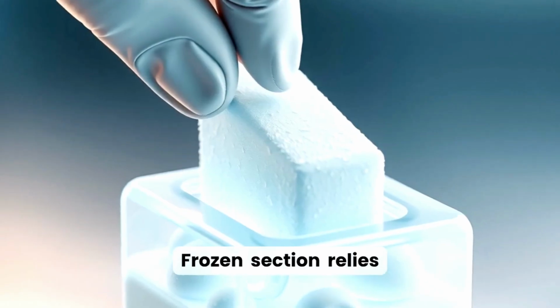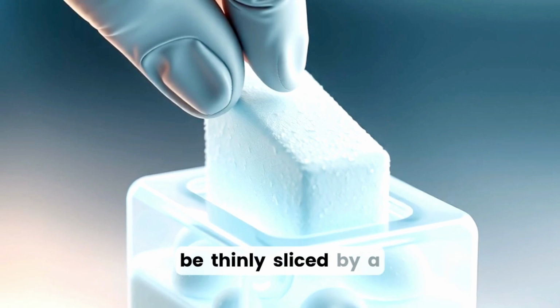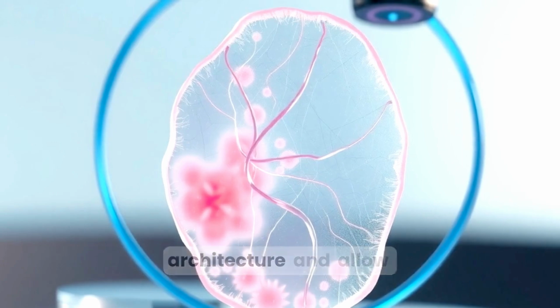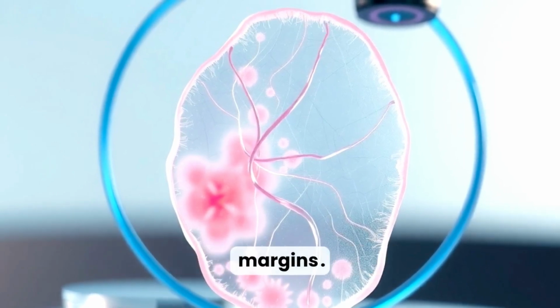Frozen section relies on rapid freezing of tissue to create a rigid block that can be thinly sliced by a microtome blade. Thinness is critical. Thin sections maintain architecture and allow accurate microscopic assessment of cells and margins.